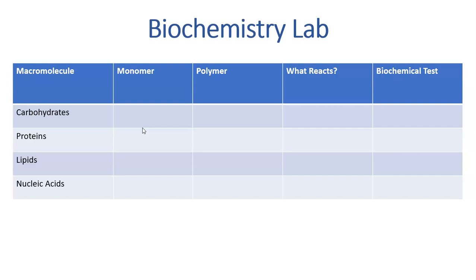because we're going to work with bacteria a lot this semester. And we're going to look at those food items and figure out whether they have carbohydrates, proteins, or lipids. These are 3 different types of macromolecules. There are actually 4 different types of macromolecules, but we're not going to work with nucleic acids this week. We're going to hang on to that for a little bit later. So our goal is to determine whether these foods have any of these carbohydrates, proteins, lipids, or nucleic acids.